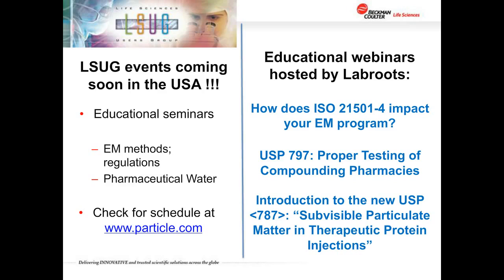Generally, concentration limit, and I think Dominique is probably looking at the maximum level, is something that doesn't need to be tested at each and every 21501-4 calibration in the field.